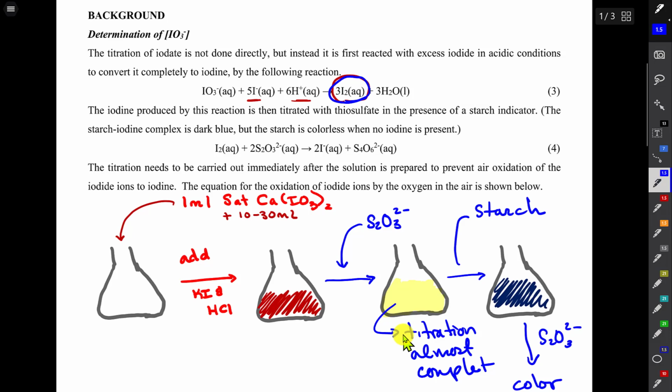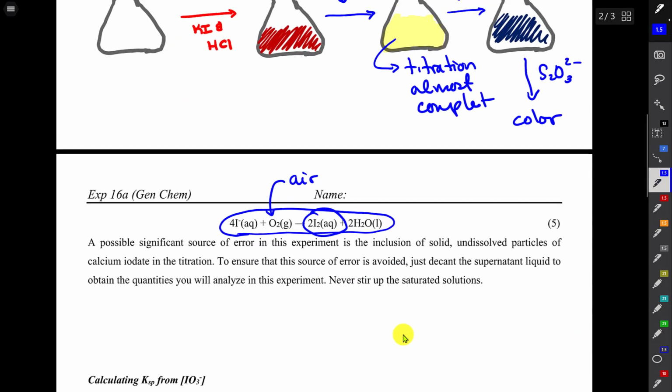So while I say you want to swirl it, you also want to titrate very quickly. So once you get this first titration done, take a note of the volume, and when you repeat the second titration, just add in 90% of your titrant, your thiosulfate, and then swirl it one time, and you'll see it all react, and then go a little bit slower after that.